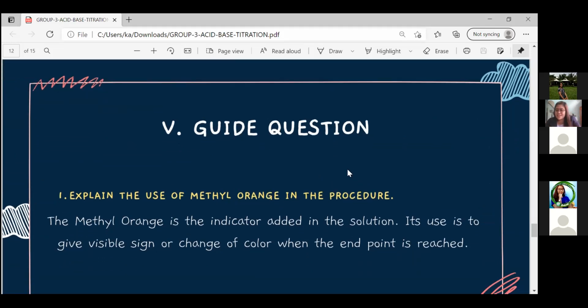Wala questions? Kaya? So, i-summarize na to ha. The first step is to compute for the amount in grams of our titrant. In this case, that's sulfuric acid. Tapos, ang second step is to compute for the amount of the sample using our stoichiometry pattern.